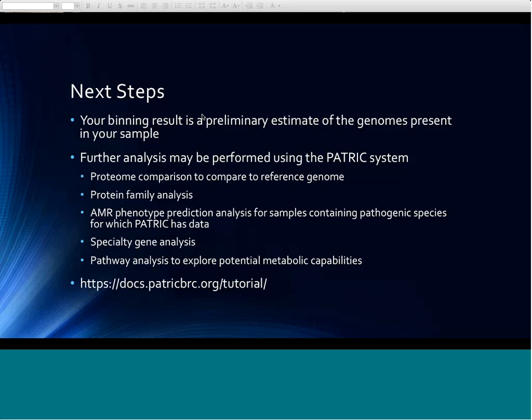Okay. What can I do with what the service considers a quote-unquote bad bin? That is, all the same things you demonstrated with the good bins or quasi-genomes. Can I take my stuff from my bad bins and do the subsequent analysis, I believe is the question. Yep, you can. All of the bins, both good and bad, are integrated into your private genome set at PATRIC. And in particular, it's interesting to go through the problematic roles on the bad bins, and you can get a feel for what's going wrong with those bad bins as well.